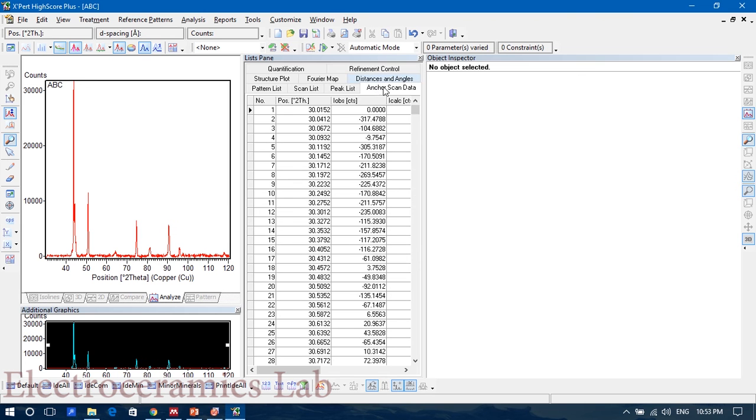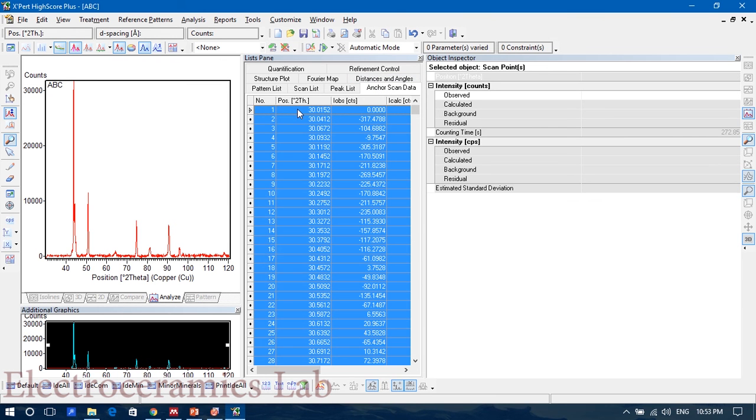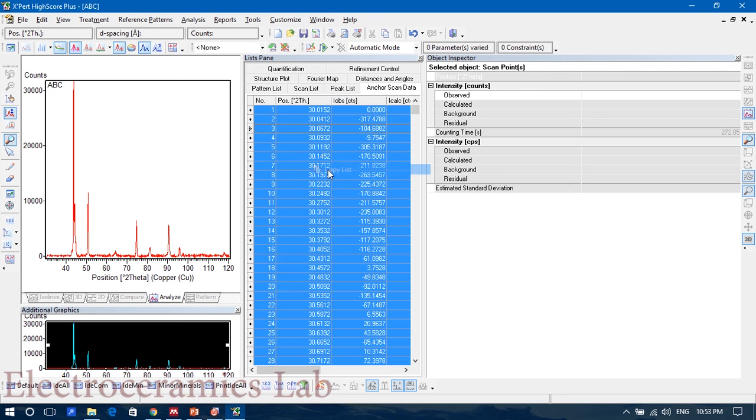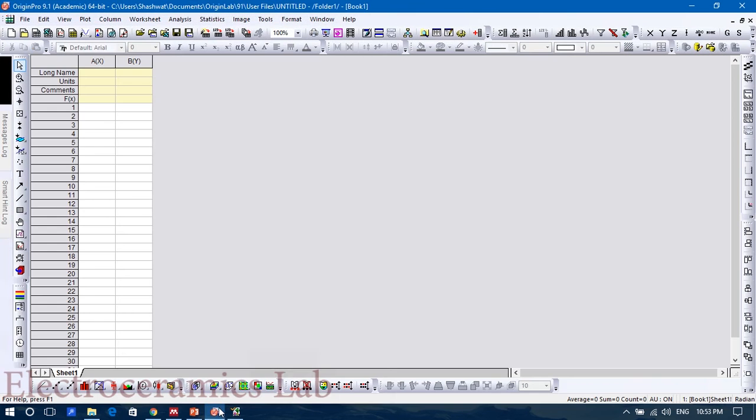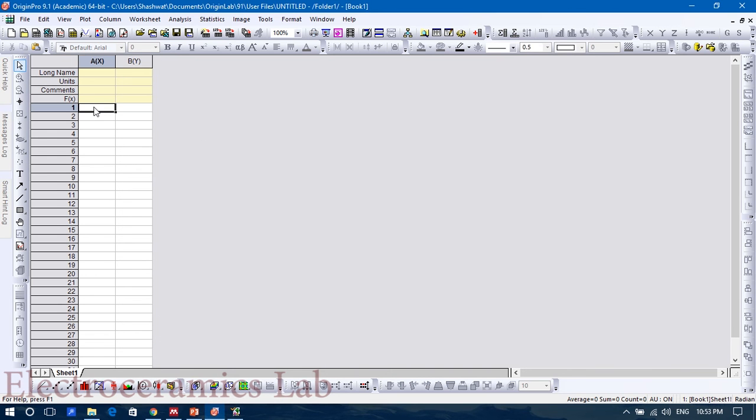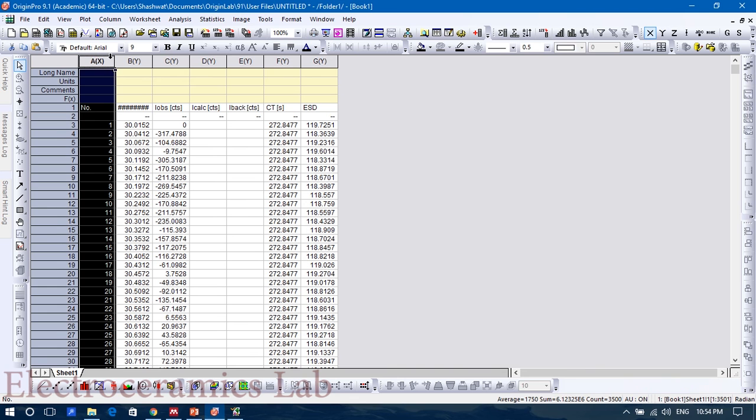And you just click there and copy all. Then open your Origin or some data managing analysis software like Excel and then directly copy there. You can delete these columns.